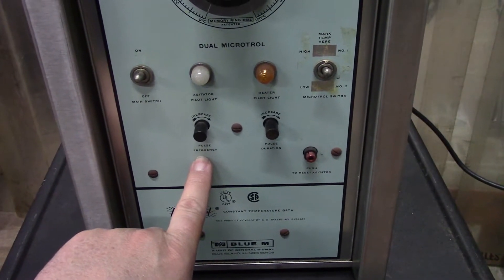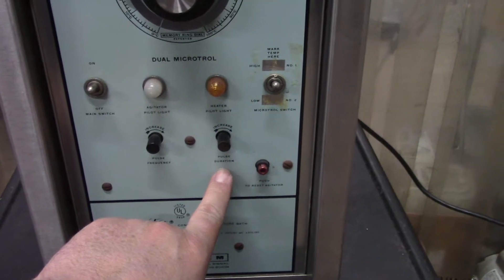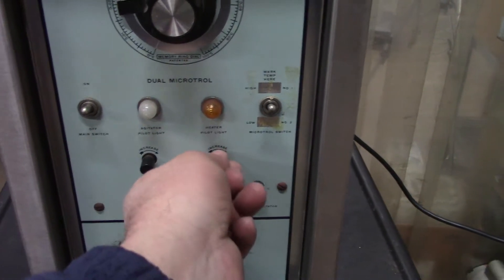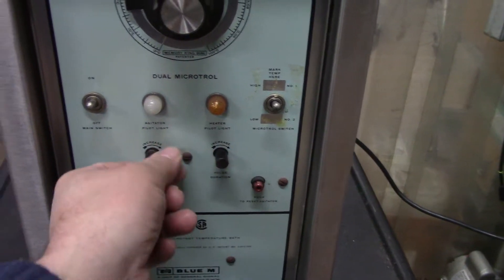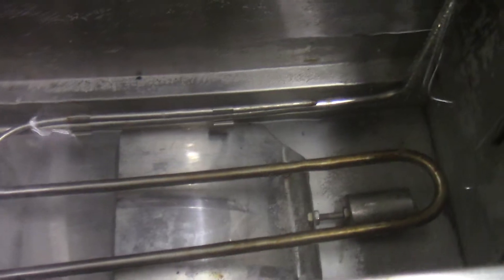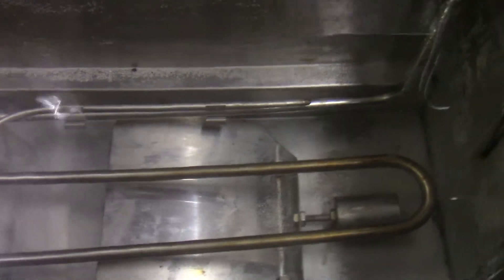This decreases the frequency of the pulse, and this is the duration of the pulse, which can be increased or decreased. Again, it's supposed to be a very light pulsing to move the water around to get a constant temperature.